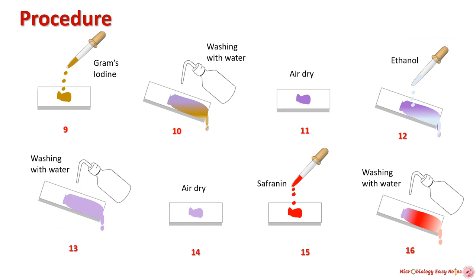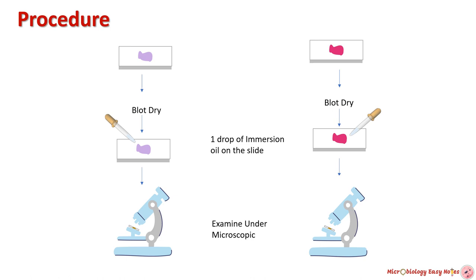Add a few drops of crystal violet. After a minute, gently wash the slide with water and air dry. Now add a few drops of Gram's iodine. After a minute, gently wash the slide with water and air dry. Now wash the slide with ethanol by tilting the slide until the ethanol runs clear, then gently wash with water and air dry. Add a few drops of safranin. After a minute, gently wash with water, air dry, and remove excess water using blotting paper. Put one drop of immersion oil on the slide and observe it under the microscope.